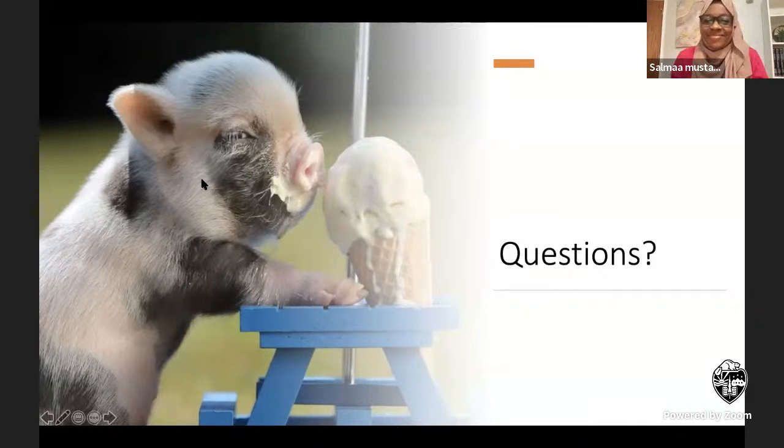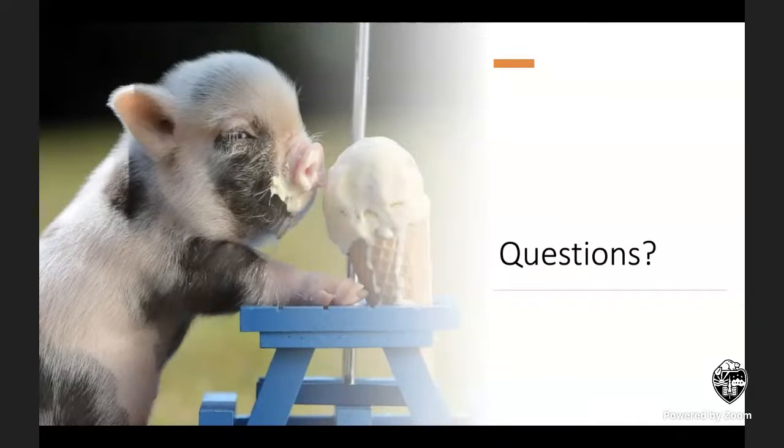Yes, I can. First of all, I want to thank you for the simple presentation on IFA, and it was rich with information. So I have one question about the optimization of the IFA. You mentioned earlier the numbers of cells. We need to know the exact number, or not exactly, we need to calculate the numbers of cells before we start the experiment, right?